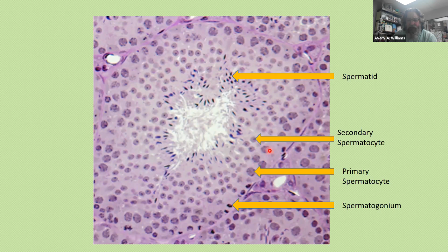These big ones right here, see these fat ones that are right next to them? These are called primary spermatocytes. We identify these big primary spermatocytes because these are the cells that are destined to undergo meiosis. They're chosen to undergo this reduction division. Spermatogonia make copies of themselves, and after puberty, they'll spit out a primary spermatocyte every once in a while. So both the spermatogonia and primary spermatocytes are genetically identical.